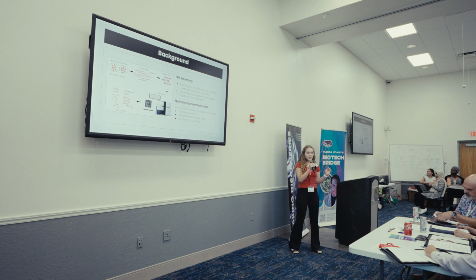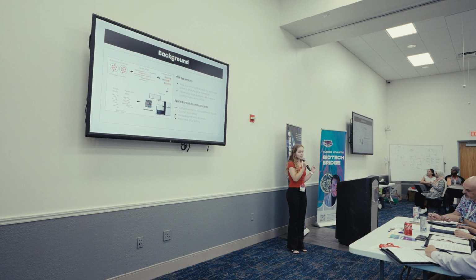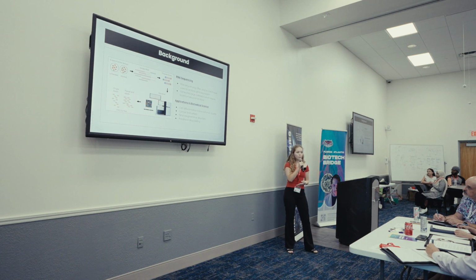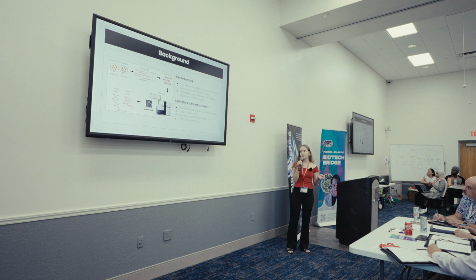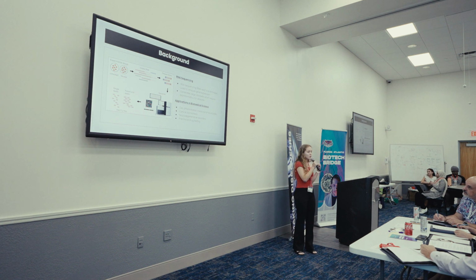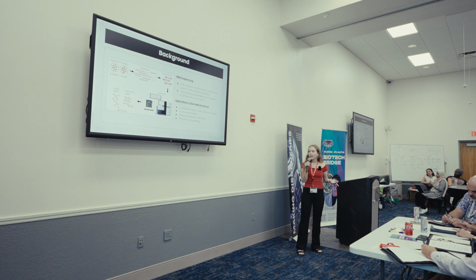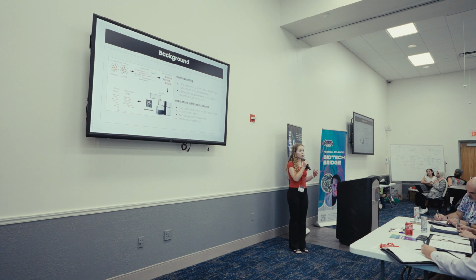And the applications that RNA sequencing has in biomedical science have become prevalent in recent decades because of the rise of genetics technologies. Now, it's important to cell differentiation transcriptomic studies, and it can be helpful to identify cancer biomarkers based on the transcriptome. Additionally, it has been extensively used to research neurodegenerative disorders such as Huntington's disease and Alzheimer's disease, and it is also critical to preclinical drug testing.